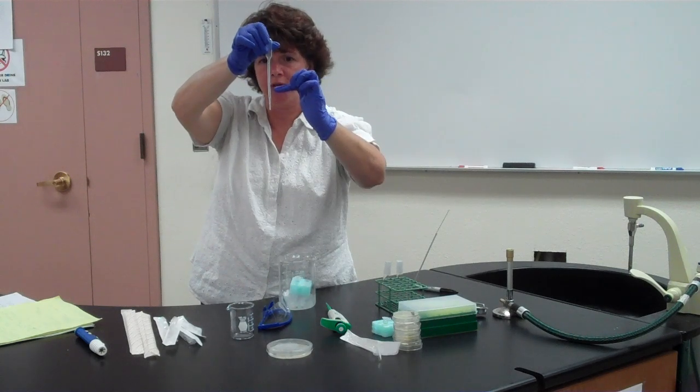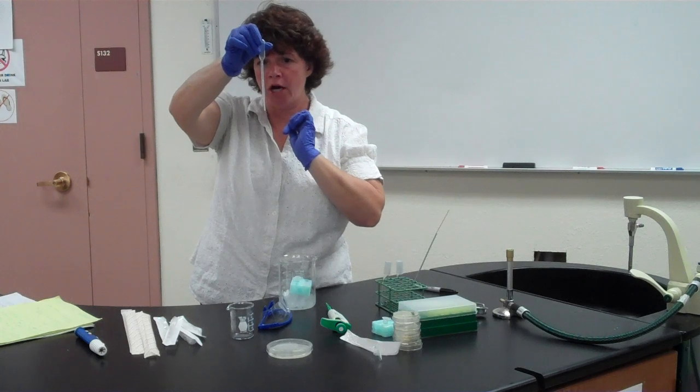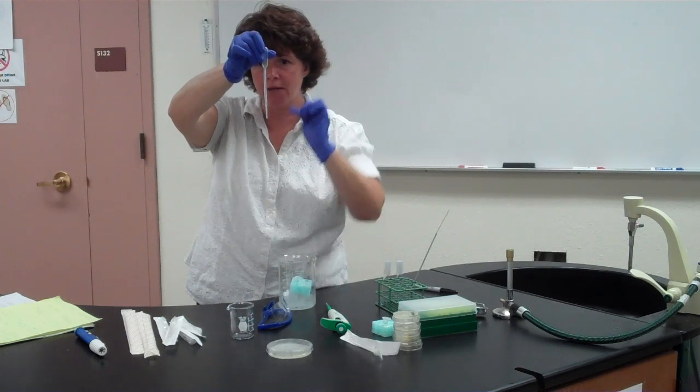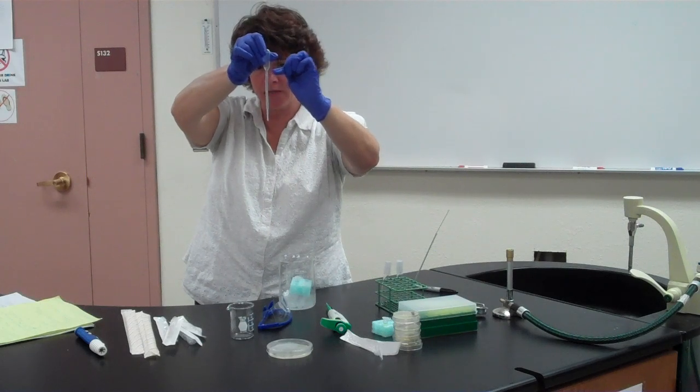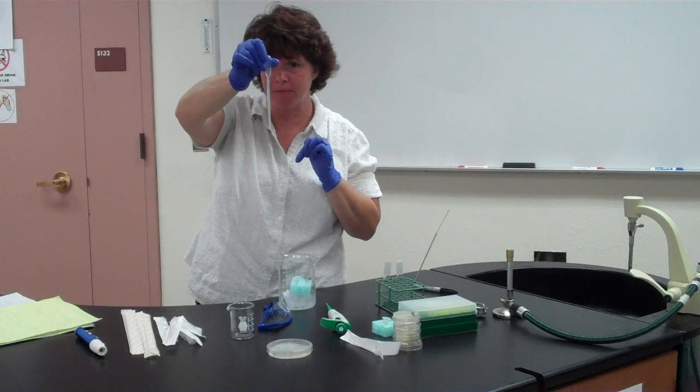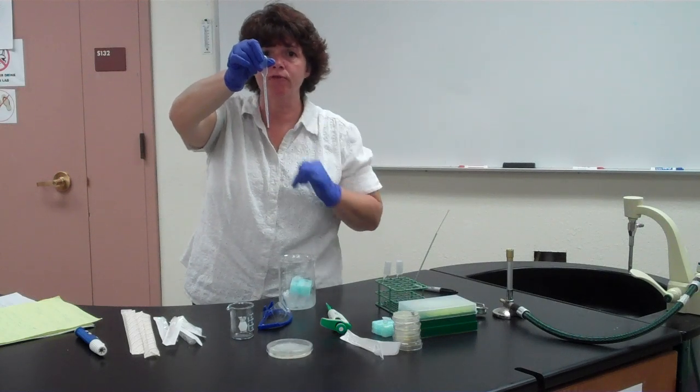So you're going to that first notch, not the very end of where it gets fat, but the next notch up. You can see this one has a 5 and that one has a 1. We're doing half of 5, so we're doing 250 microliters or 0.25 mils.